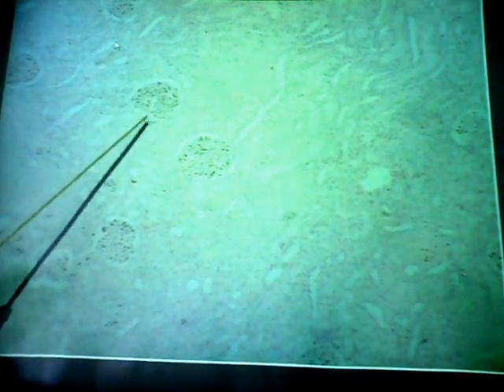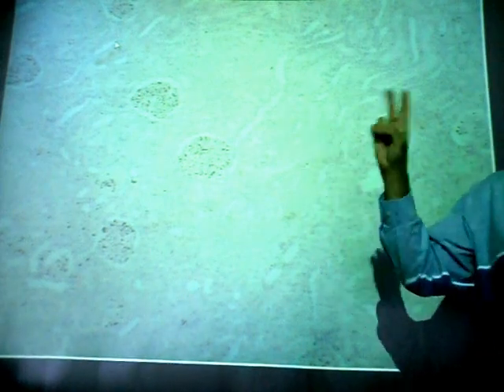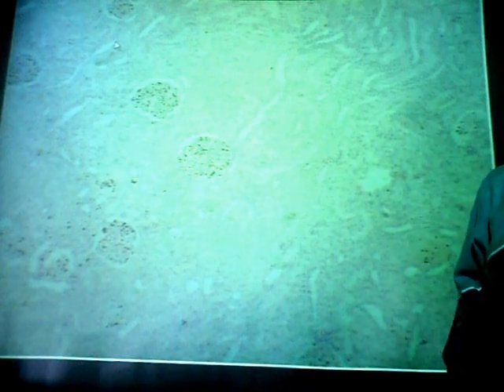And again, the renal corpuscle consists of this capillary network here called the glomerulus or glomerular capillaries, surrounded by the collecting chamber, which is the Bowman's capsule or glomerular capsule. You've also got sections through many tubes here, most of which are parts of the nephron. Namely, proximal convoluted tubules, distal convoluted tubules, and parts of loops of Henle are all found here in the cortex. In fact, the majority of the nephron is found in the cortex.